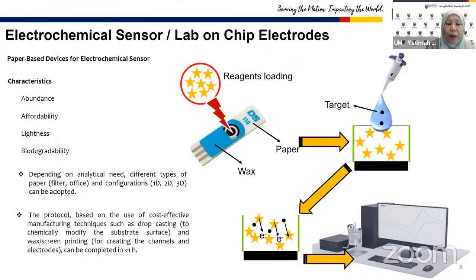So the protocol is based on the use of cost-effective manufacturing techniques such as drop casting and wax screen printing, and it can also be completed within less than an hour.